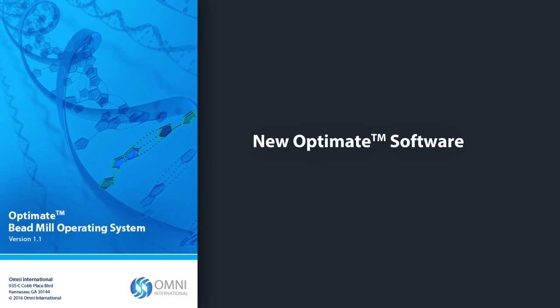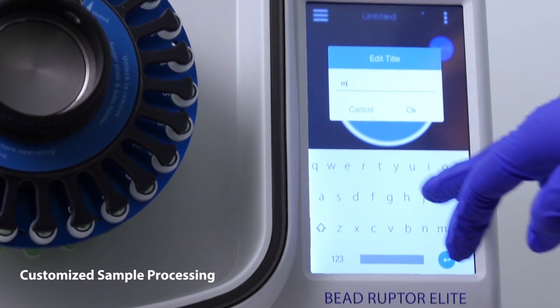New OptiMate software with programmable speed, time and cycles for customized sample processing.